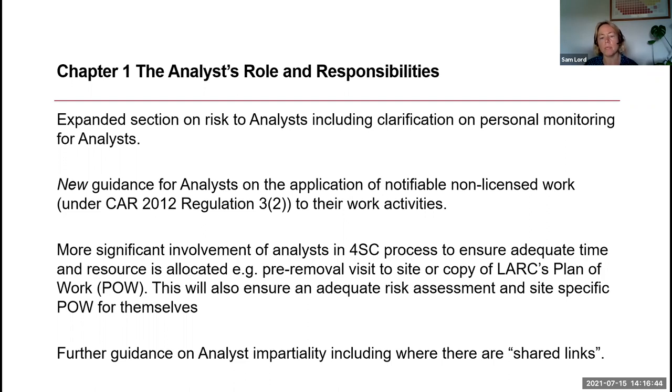There's also really this, and this is a thread that goes through the new guidance, about getting analysts to be a bit more involved, particularly in the four-stage clearance process. And this is really, as I said earlier, about ensuring that they actually have enough time and resource to do their job properly. And in order to do that, like anything, you've got to know what you're getting yourself in for. So a pre-removal visit possibly, or maybe a copy of the licensed removal contractor's plan of work, which will obviously be produced in advance for licensed work. That will give them an idea of the extent, the size of the job.